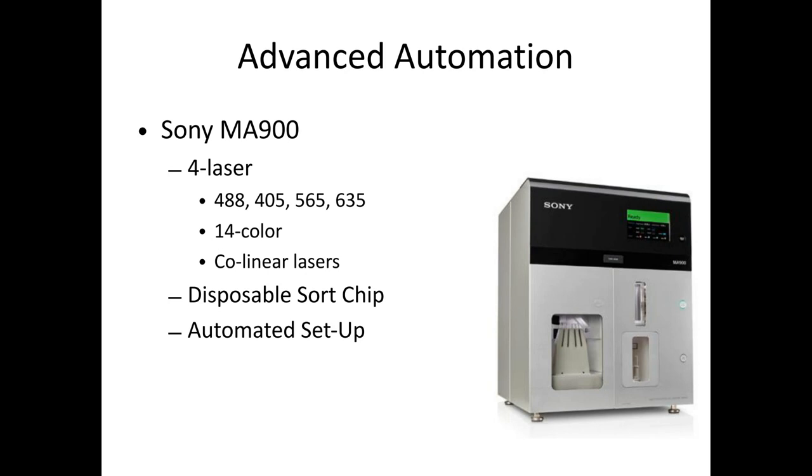I was hoping to make these user accessible machines like other labs have, but the user base at Scripps, I don't know if they're just lazy or just so in love with our service that they would rather have us do the work and just drop their samples off. So this machine's really nice, but what made this machine super cool was the finish. And I think it came from the Sony consumer electronics philosophy that everything worked really nice. The automation, the finish, the fit, it was all really cool. The workflow was really cool. It was a well done piece of instrumentation. Now, it didn't have all the traits of the previous instruments, so it just wasn't perfect.